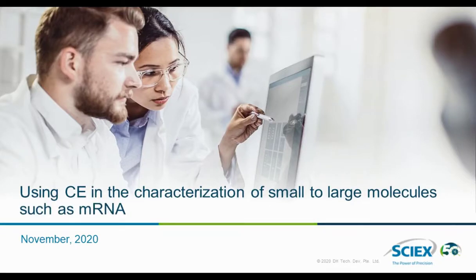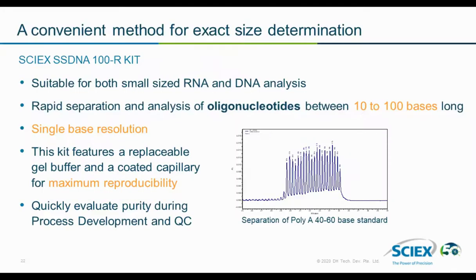So in the next couple of slides, in the next 10 to 15 minutes, I'll discuss how CE, or capillary electrophoresis, is used in the characterization of small to large RNA molecules. And even looking at some RNA molecules which are greater than a couple of thousand bases long.